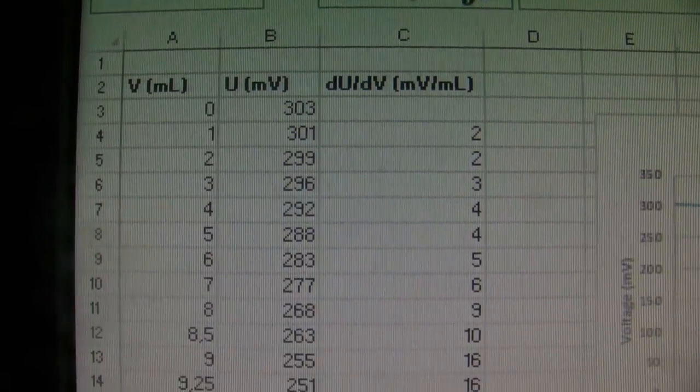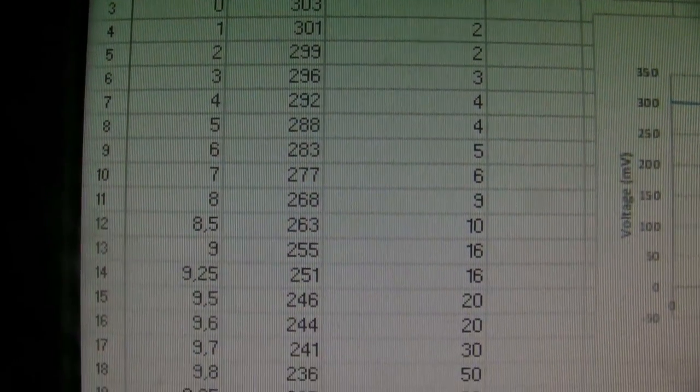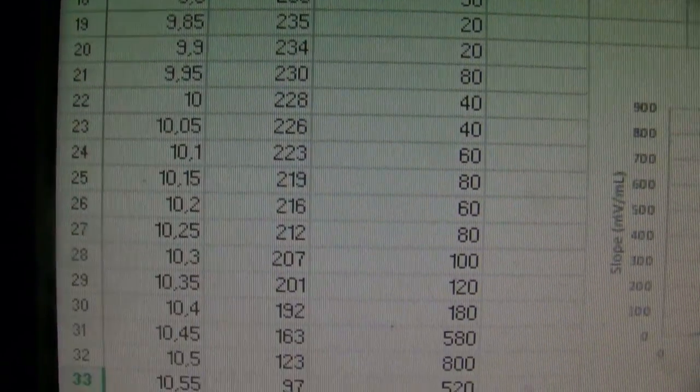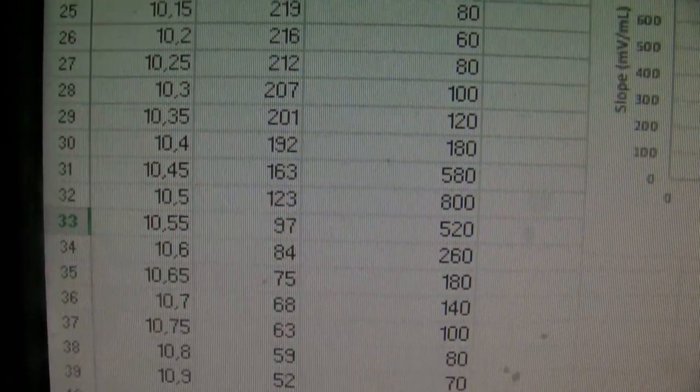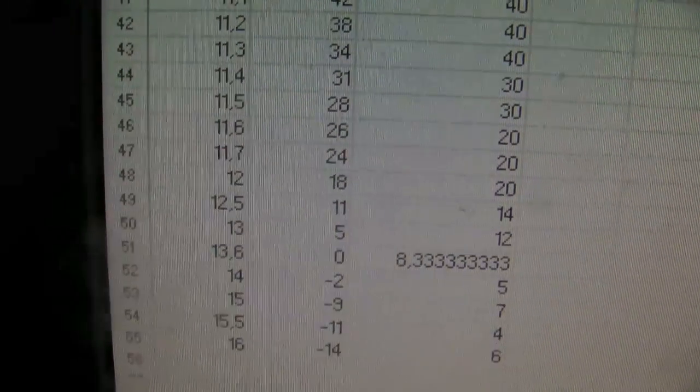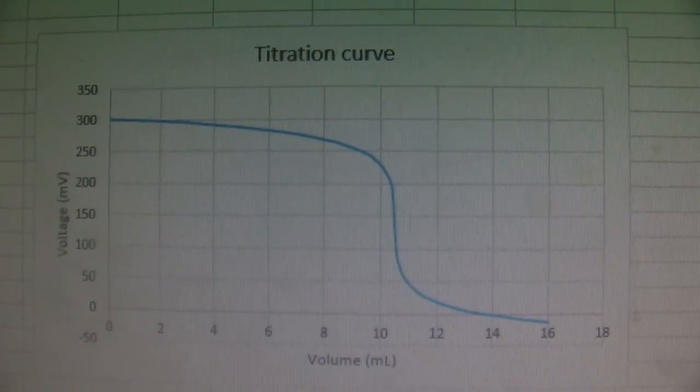The measured values were then written into a table and the value of the slope was calculated. It can be seen that the slope increases to a point and then decreases again. When it is plotted, the following curve can be observed.